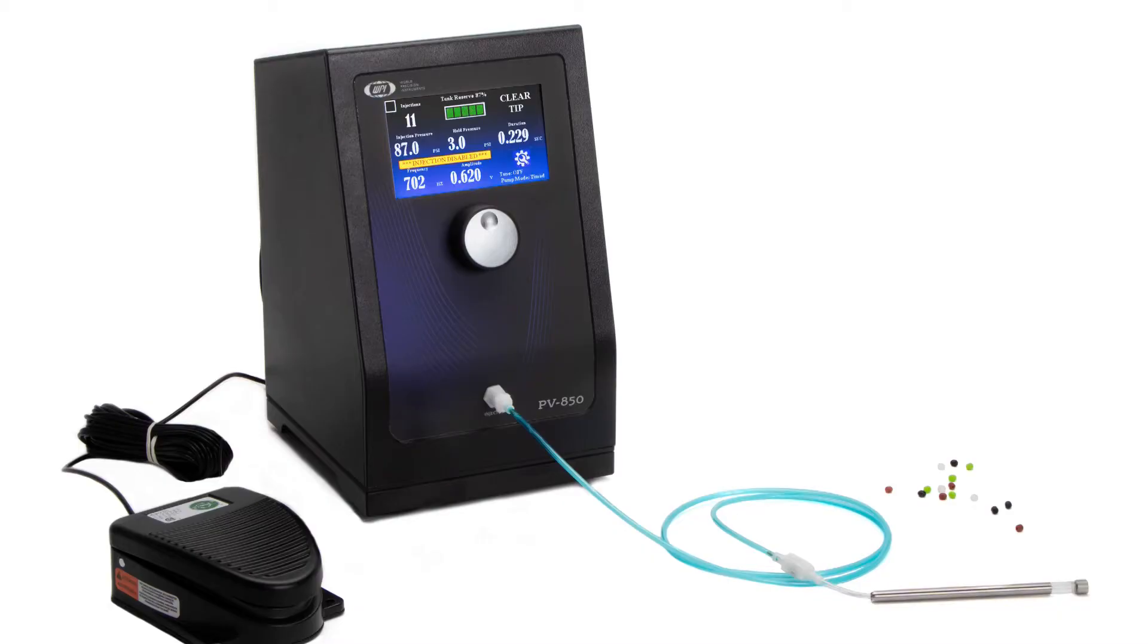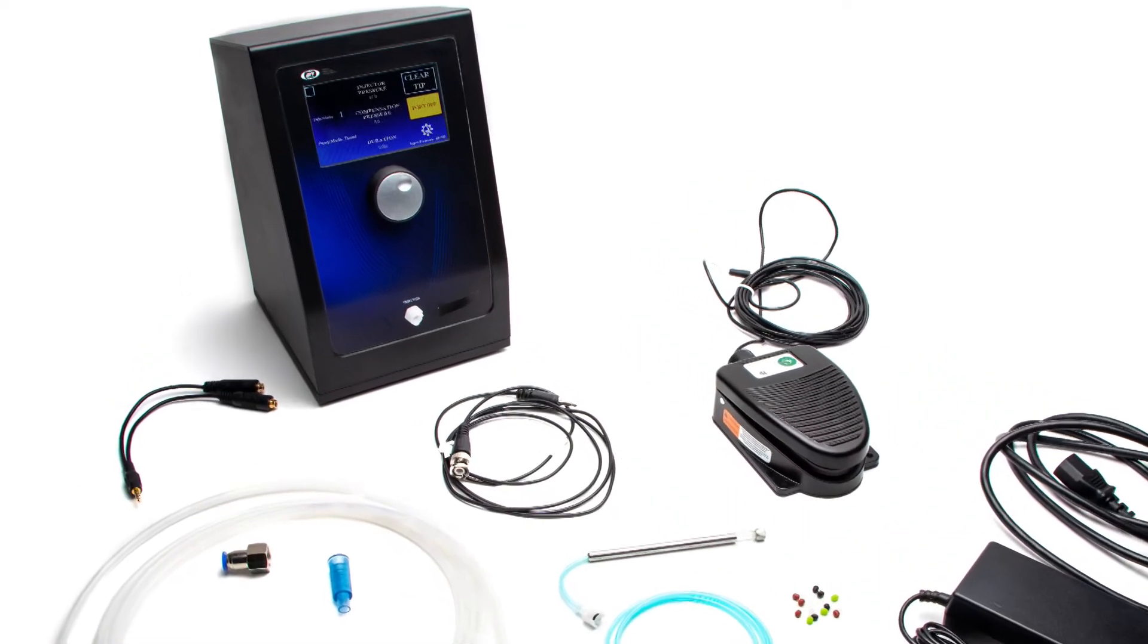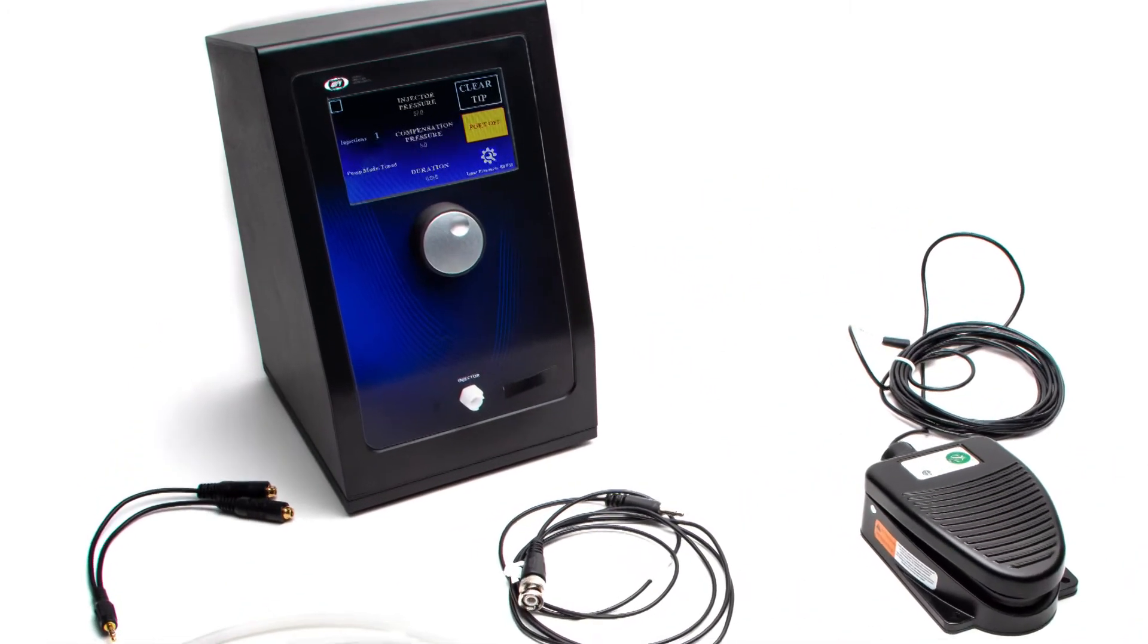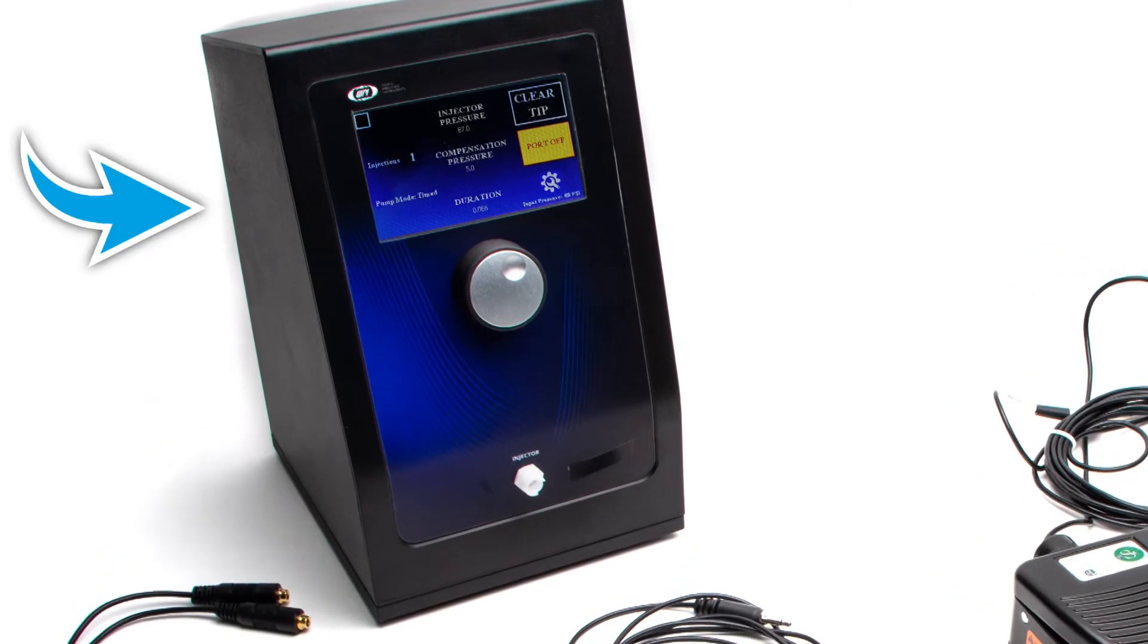The PV850 injector is designed to simplify intracellular injection and we'll show you how to set it up. The system includes the following components.